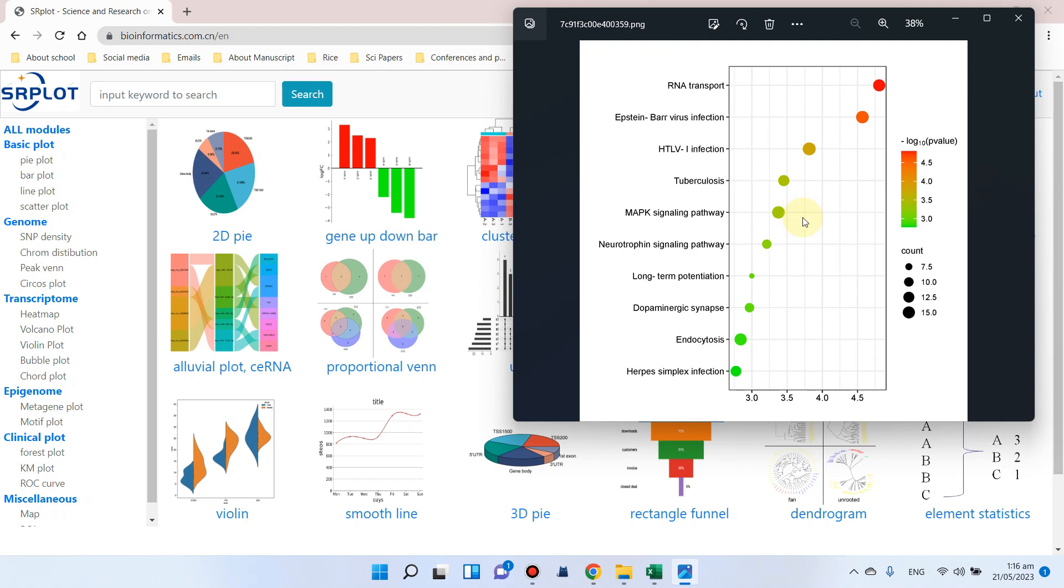Here you can see the different pathways, enrichment factor, p-value, and number of genes. Let me show you how we can draw this graph using a simple web tool.